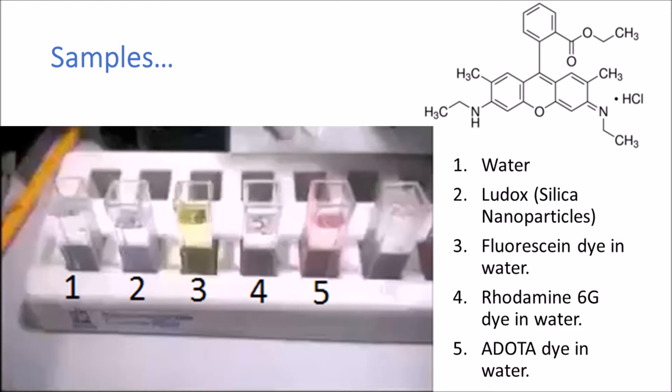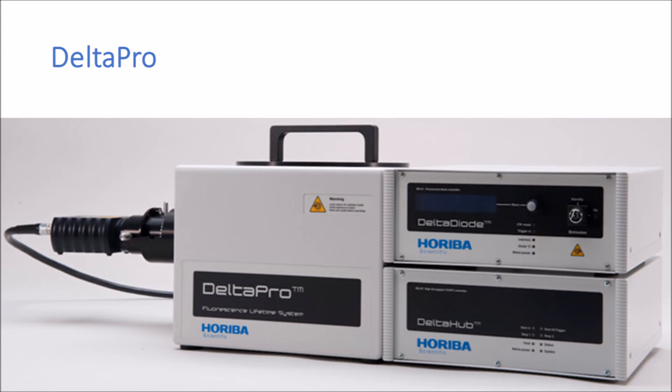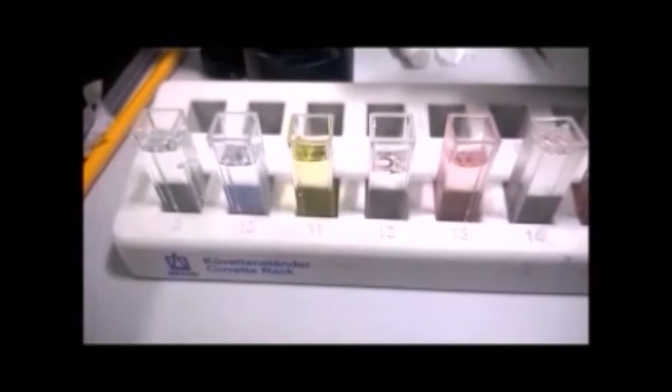Instead of looking at these samples using standard room light, I'm going to examine them using a laser. I'm going to use a delta diode 510 laser, which is manufactured at Horiba Scientific IBH, and attach it to one of our simplest filter-based sample chambers.